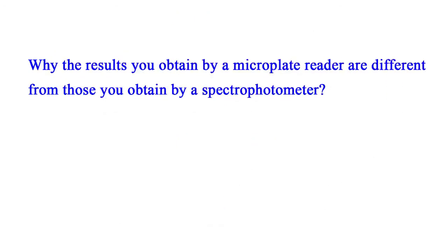Please pay attention that the absorbances you measure by a microplate reader are different from those you measure by a spectrophotometer using a 1 centimeter cuvette.